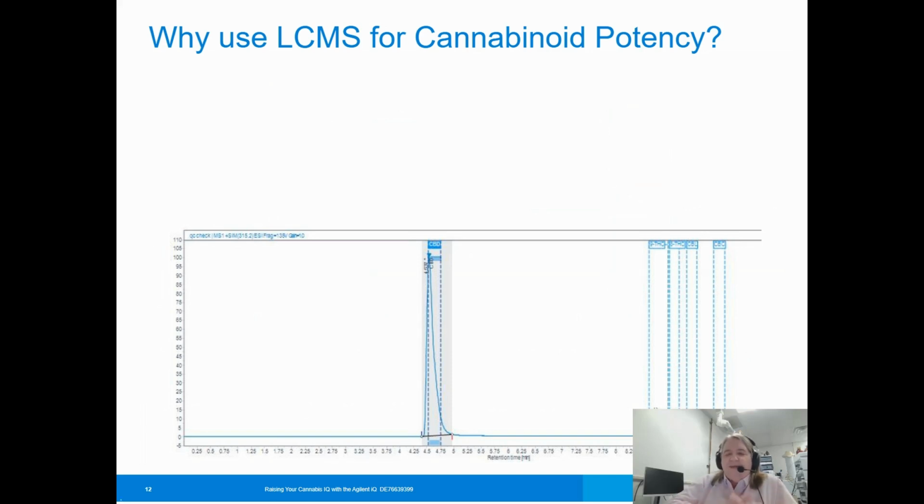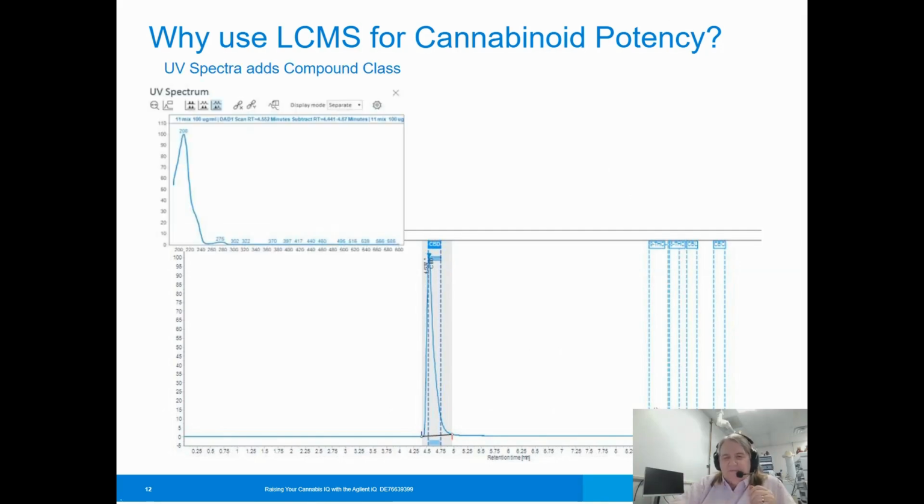Okay. So why should I use LCMS for cannabis? I mean, what is it going to really do for me? What will it add to me? Let's take a look at this. Again, a very highly uninteresting spectrum, wouldn't you think? It's not really great to match. I mean, it could be a preponderance of other things.